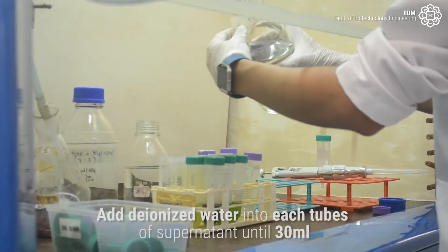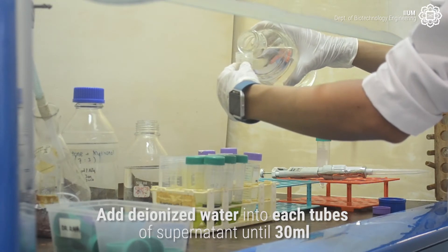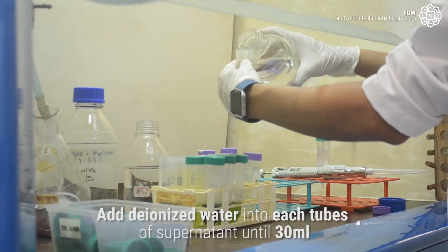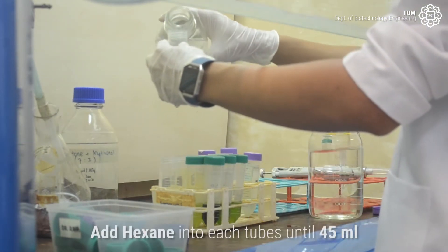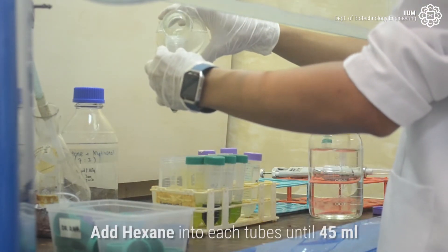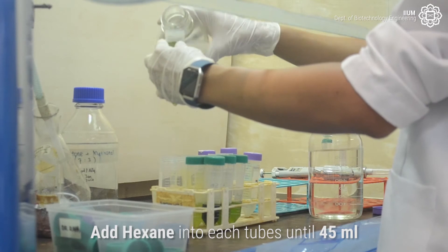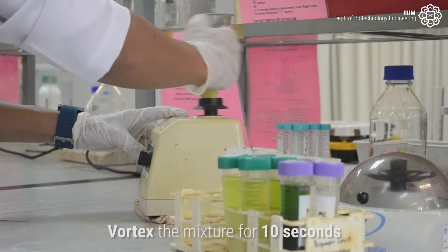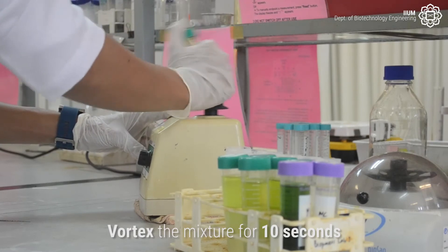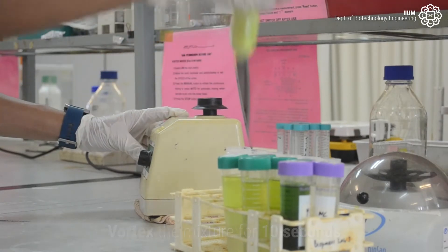Add Deionized Water into each tube of supernatant until 30 ml. Then add Hexane into each tube until 45 ml.